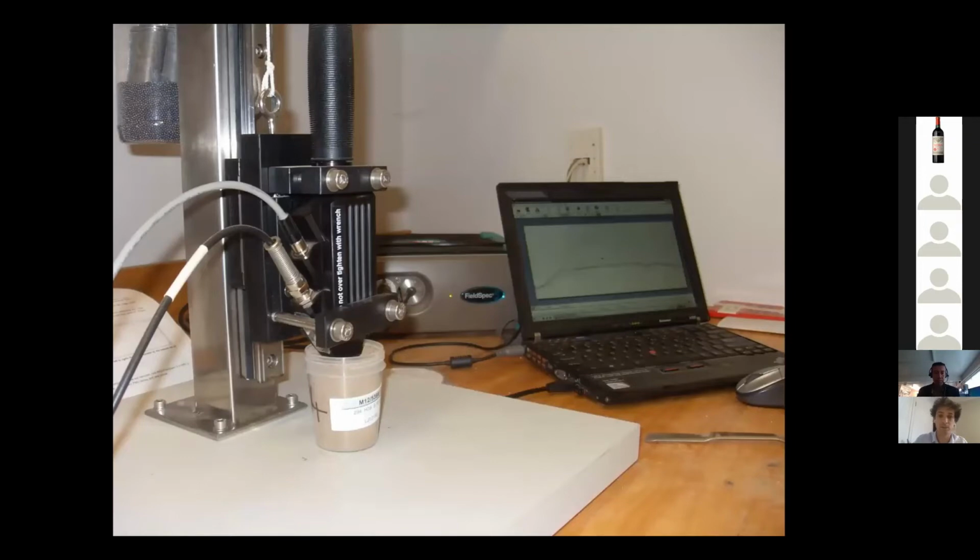And so we started using that in the lab. What you can see here is the FieldSpec instrument in the back, connected to a laptop. You can see some soil spectra here. They're fairly flat, and I'll get back to that later. And here you have a contact probe that can measure the soils directly in the lab, in contact. These are soils that are all, that's how we typically store samples, when we bring them back from the field, they're just 2 millimeter sieved and air dried soils.